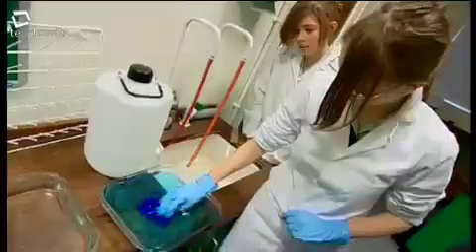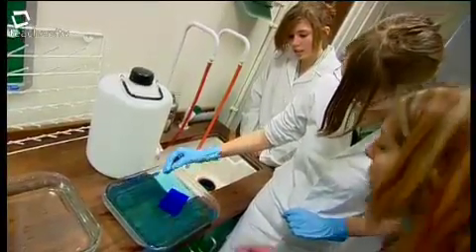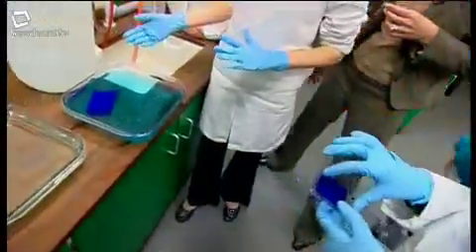One of the problems that the girls encountered at the end was actually clearing the gels using warm water. Many of them actually broke their gels in that process, so whether that could be improved on, whether we could put the gels back into trays to hold them more carefully, then many of them got to the end and they'd spoiled their gels by the time they'd finished.